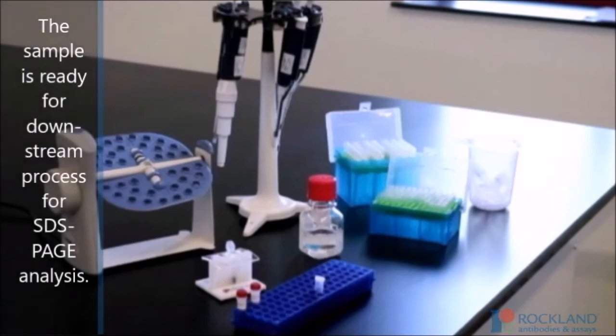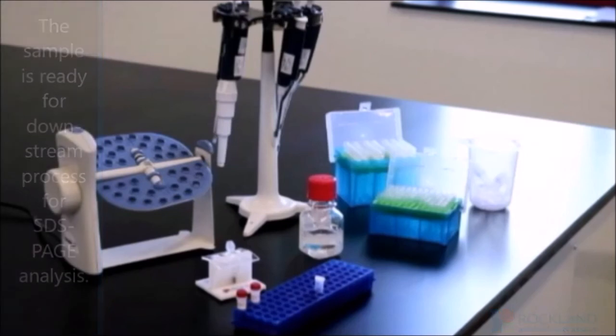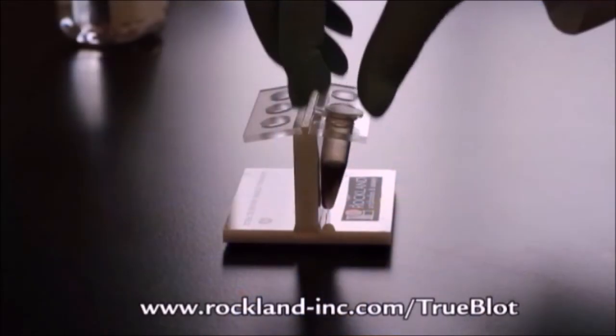The sample is ready for downstream processing for SDS-PAGE analysis. To learn more about TruBlot magnetic beads, visit www.rockland-inc.com/TruBlot.